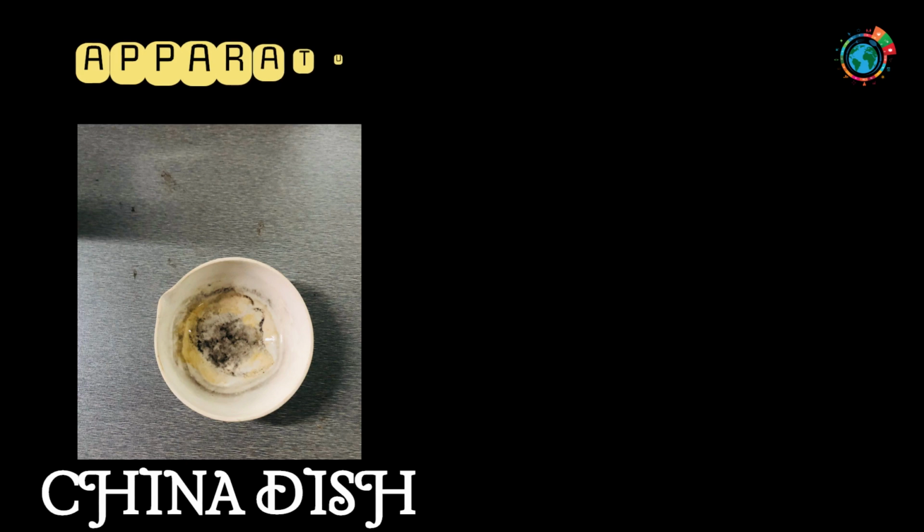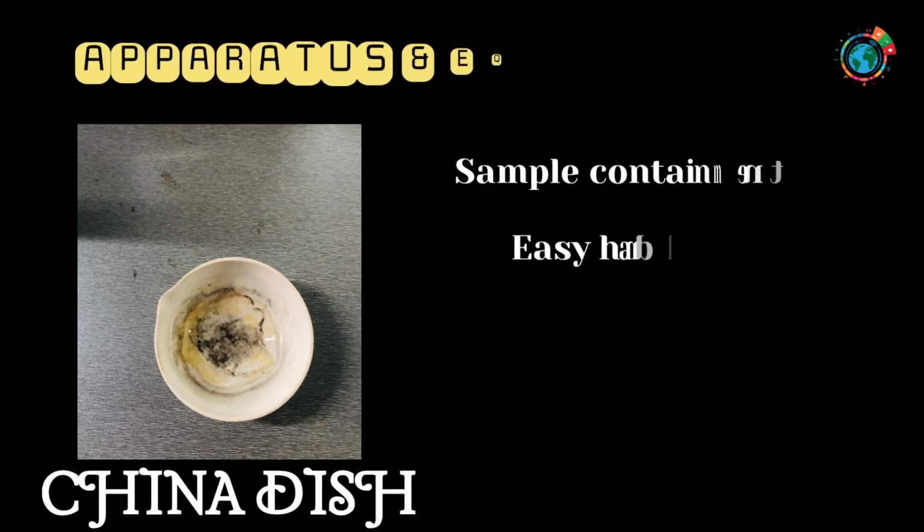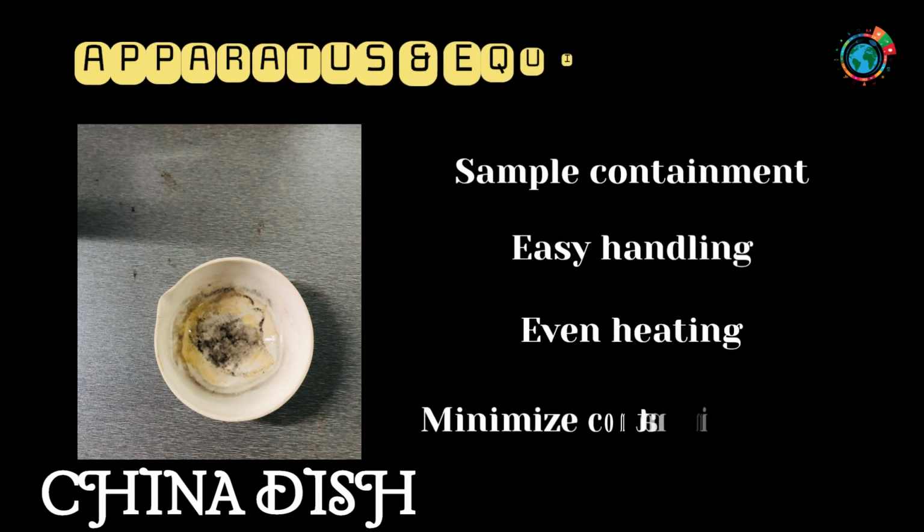To perform this analysis, we need certain apparatus and equipment. These include 1. China dish. The main purpose of the China dish in this analysis is sample containment, easy handling, even heating, and minimization of contamination.